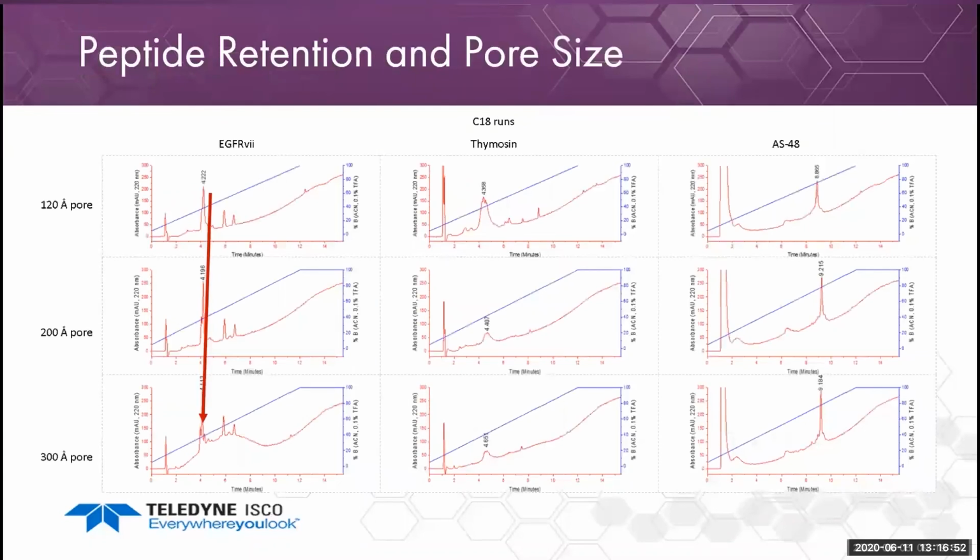EGFR acts like a small molecule in the previous slide. It exhibits reduced retention time with increasing pore size. The retention decreases from 4.2 minutes to 4.1 minutes. However, the change in retention time isn't as noticeable as the parabens shown earlier.